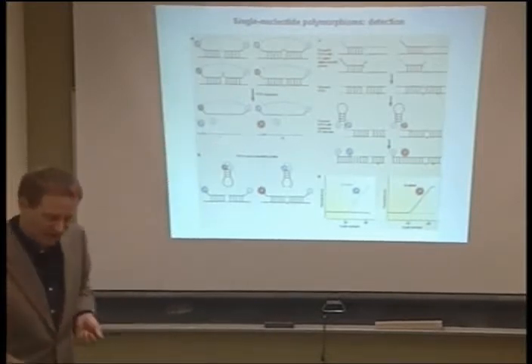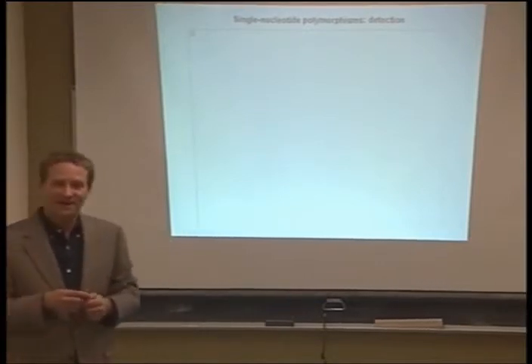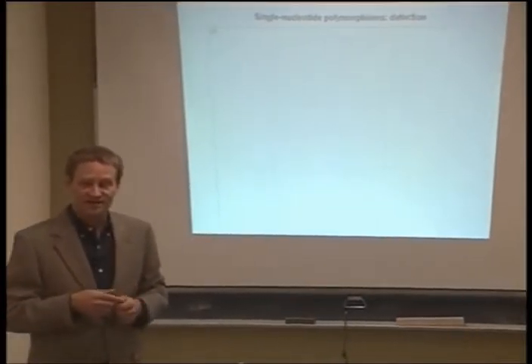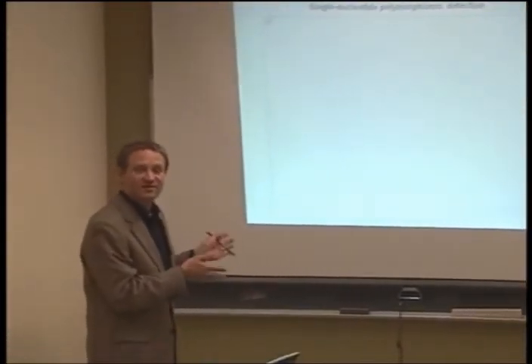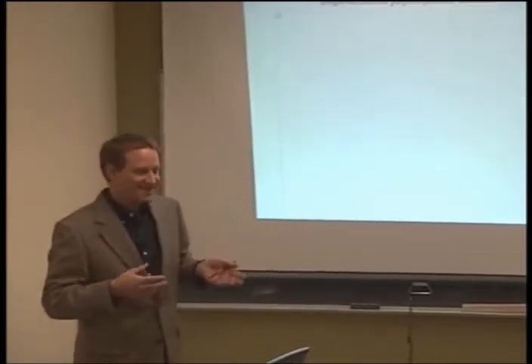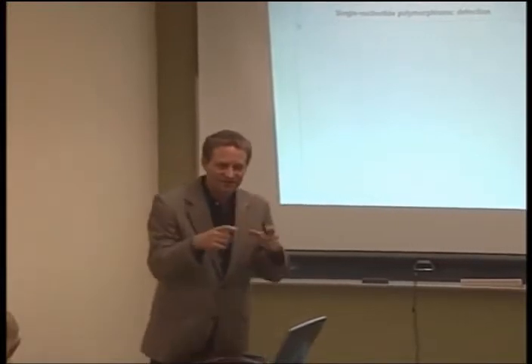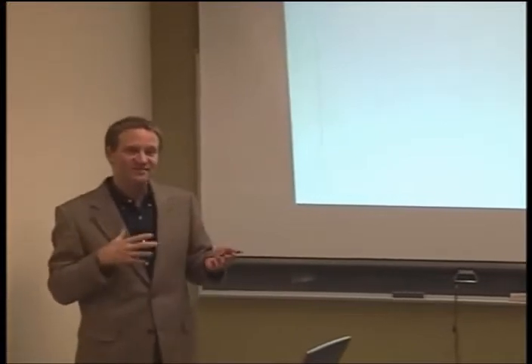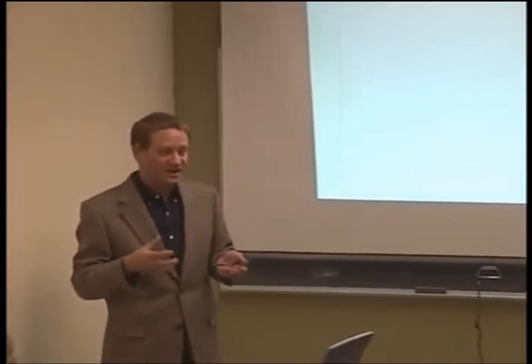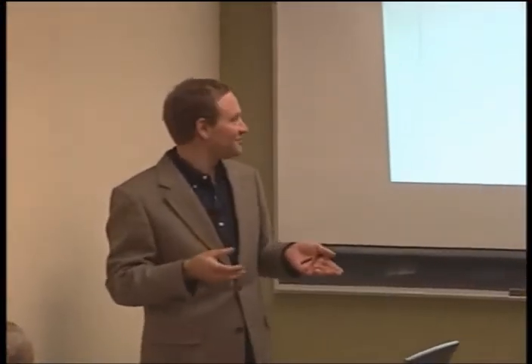Now, unfortunately, this was supposed to be a figure which showed you actual data. I wasn't going to tell what the gene was because it's secret, but it's data that I've generated for Esteban as part of his Gala study he's going to tell you about, and it shows a nice distribution for 384 samples. But to give you an idea of what this is like in the lab, essentially, just picture large stacks of plastic plates that have got 384 little wells in them, and robotics to be able to transfer and mix and heat and read these samples. It's actually quite prosaic in a way, although doing it well can be a thing of beauty. At least I think so.